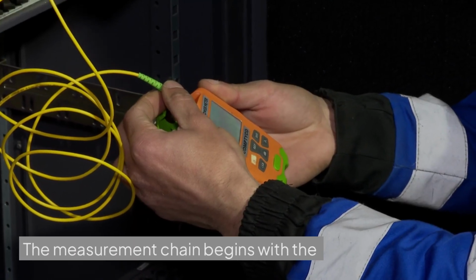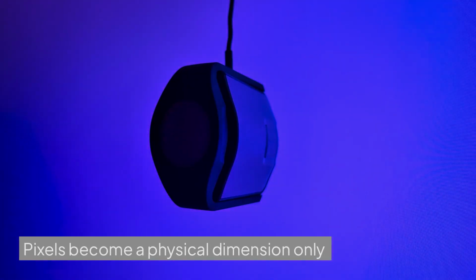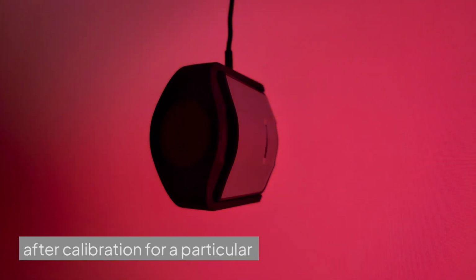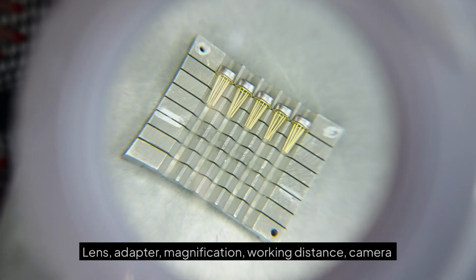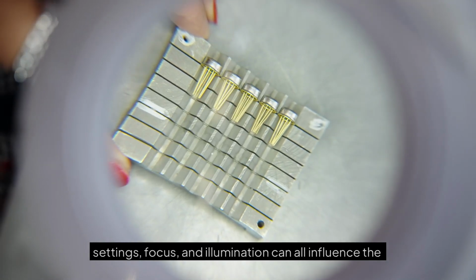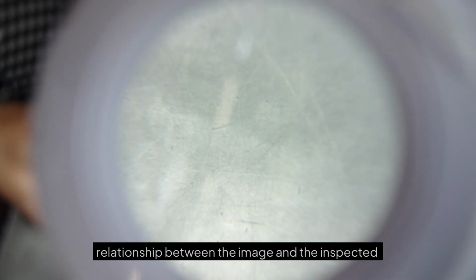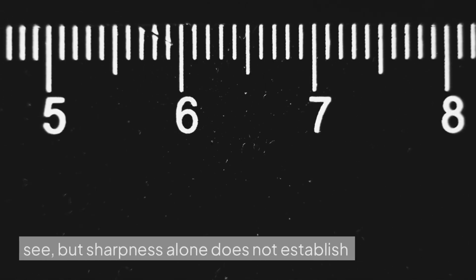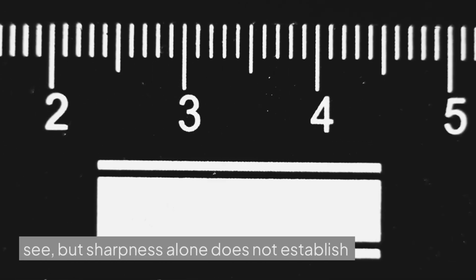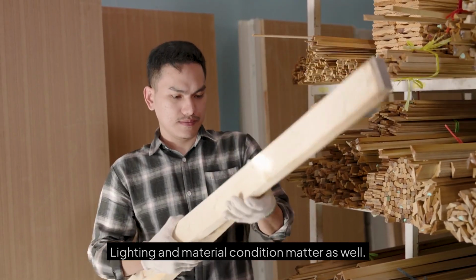The measurement chain begins with the optics. Pixels become a physical dimension only after calibration for a particular configuration. Lens, adapter, magnification, working distance, camera settings, focus, and illumination can all influence the relationship between the image and the inspected feature. A sharp image may make an edge easier to see, but sharpness alone does not establish a valid scale. Lighting and material condition matter as well.